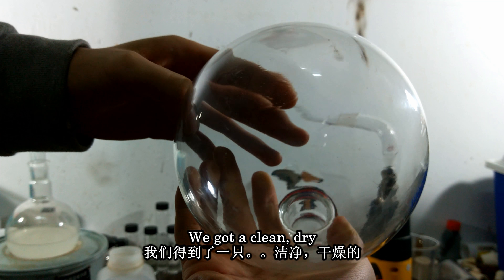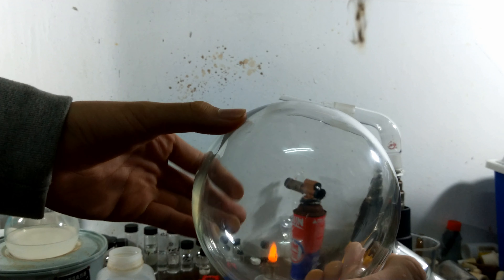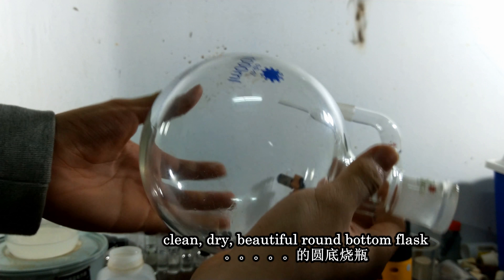You see, we got a dry, clean, beautiful round bottom flask.